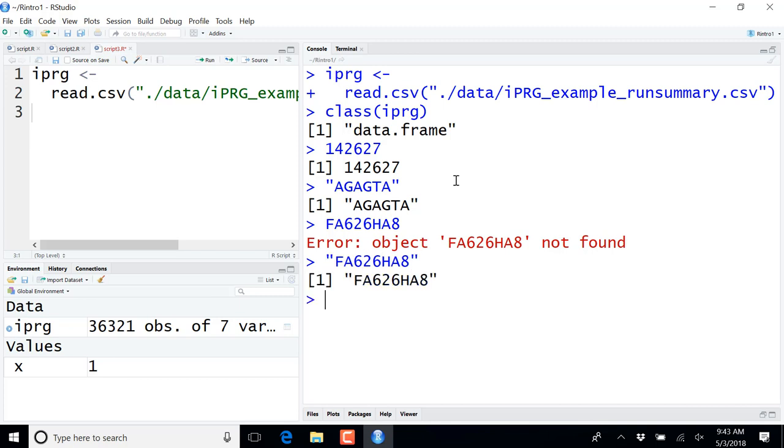And now, although we are intelligent as opposed to a computer, which is not, we can see that in this string we have letters and numbers, but that doesn't matter for the computer. Everything is quoted, so everything is a character. And so these protein accession numbers are arbitrary. Again, the computer has absolutely no clue that these are protein identifiers. We know these are Swiss-Prot identifiers. We know that these are log2 intensities. We know that these correspond to an important variable in our experimental design of the samples that we had. Of course, R is completely oblivious to this.